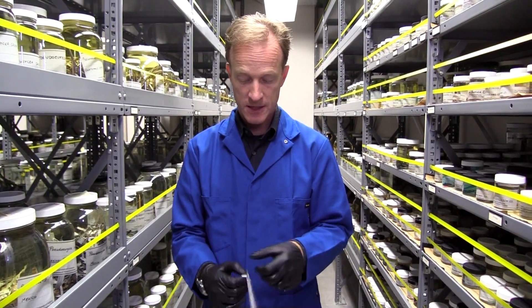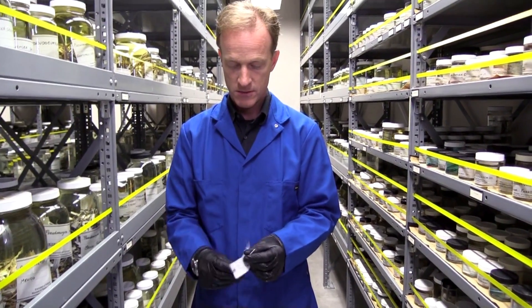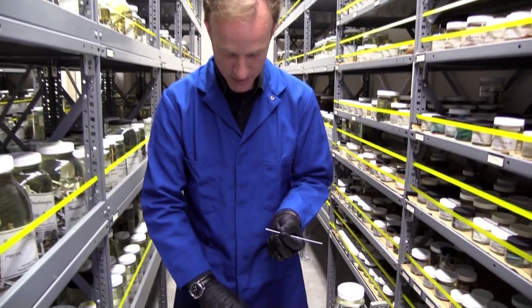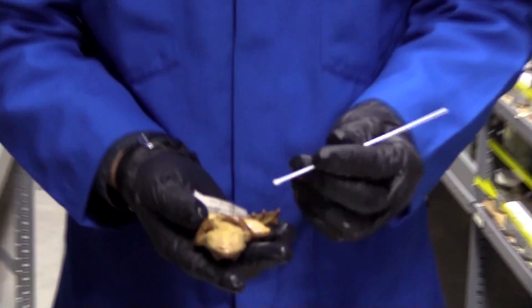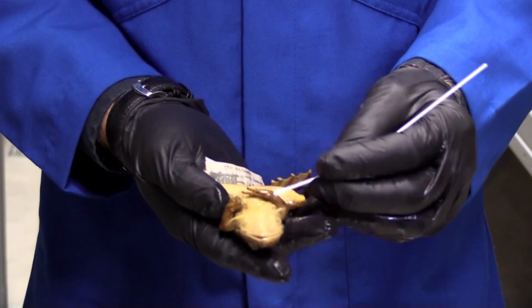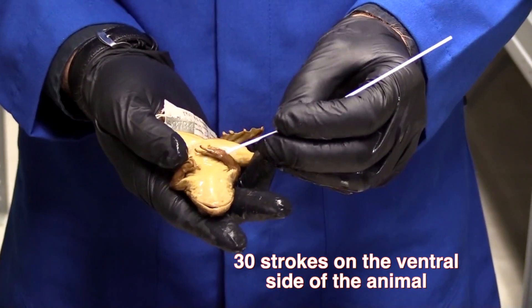Now I'm ready to collect the skin swab. Here's my swab — I open up the package and pull out the swab, then bring my frog back up. Just as with other specimens, we're going to swab the ventral side of the animal, not the dorsal side, and we're going to do about 30 strokes.